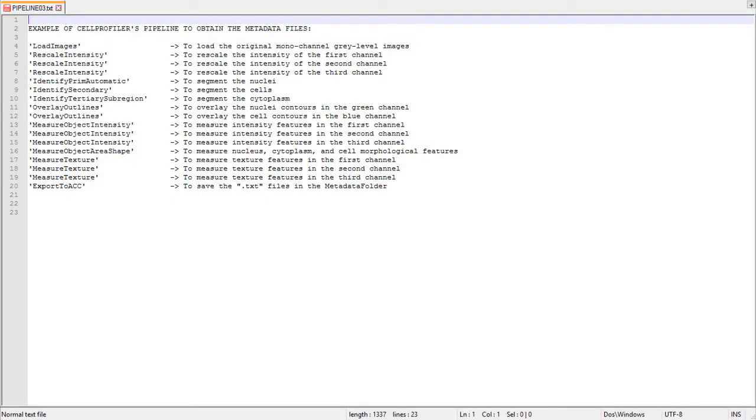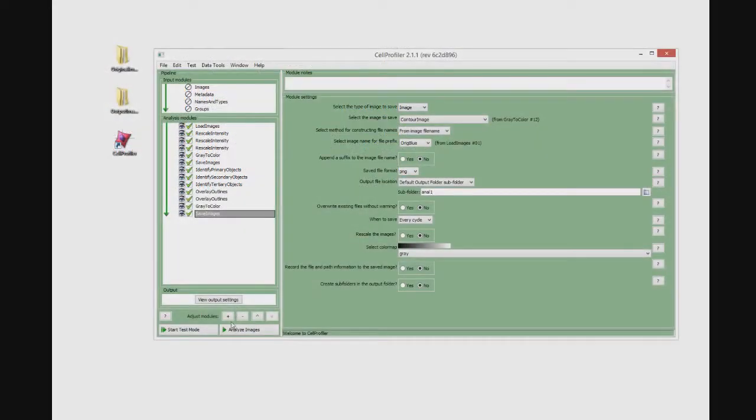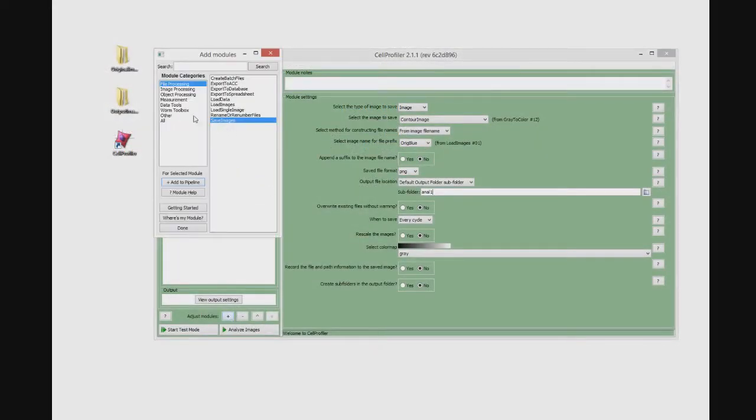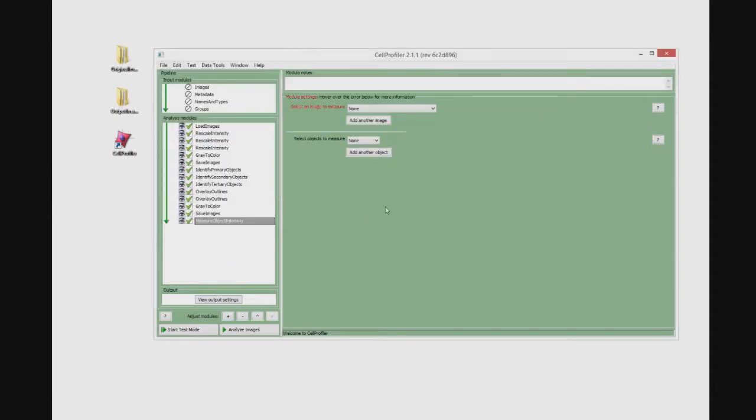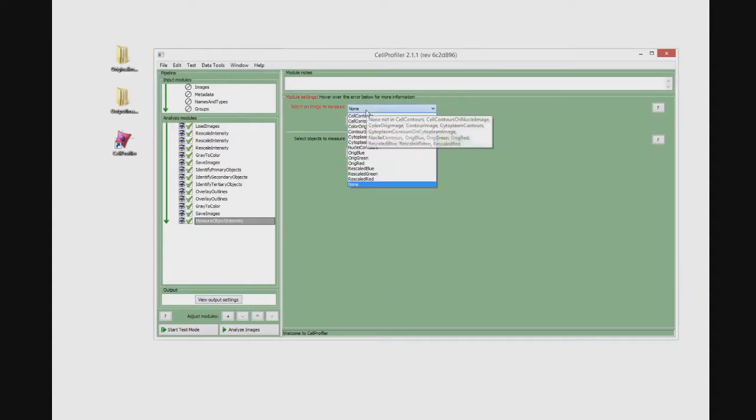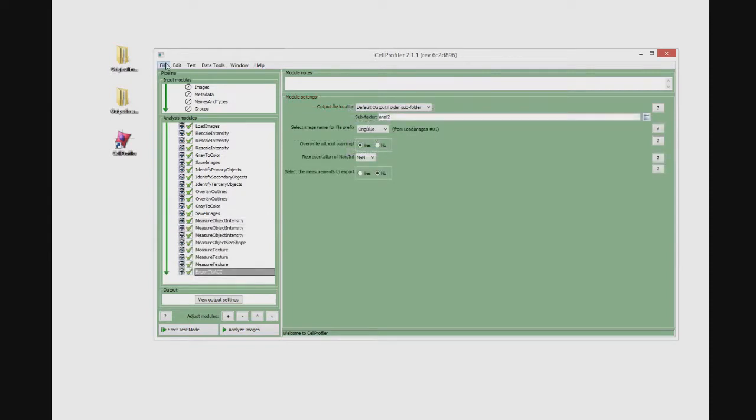Finally we will create the metadata files of numerical feature values that contain single cell data. First of all, we have to add to our pipeline the Cell Profiler modules used to extract the features. Then, we can download the Cell Profiler module designed to export the features computed using Cell Profiler to Advanced Cell Classifier from the Advanced Cell Classifier website.